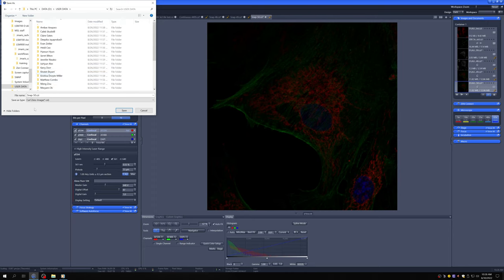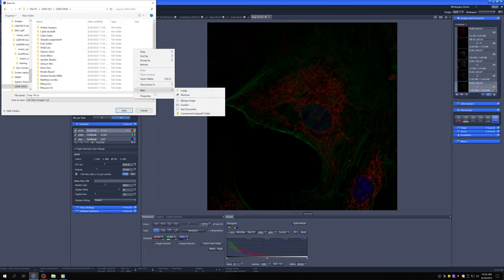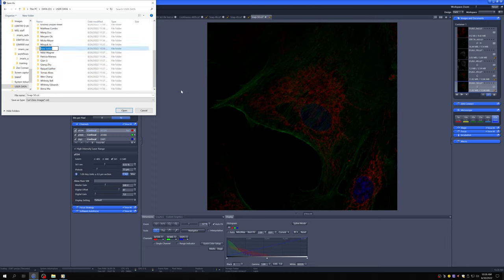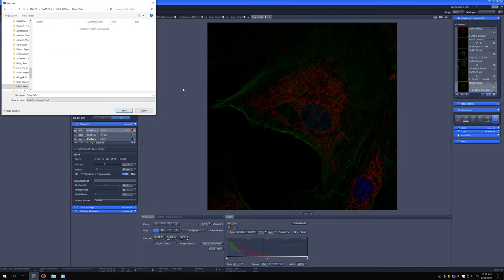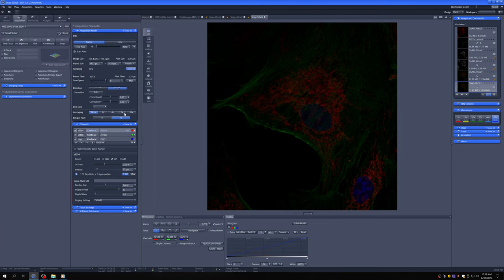So I'm gonna make a folder for myself and I'm just gonna save this image there, okay? And you can see that when I save it, this weird icon goes away.